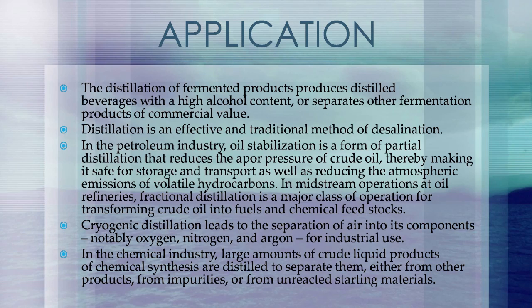In continuous distillation, the source material, vapors, and distillate are kept at a constant composition by carefully replenishing the source material and removing fractions from both vapor and liquid in the system. The result is a more detailed control of the separation process.